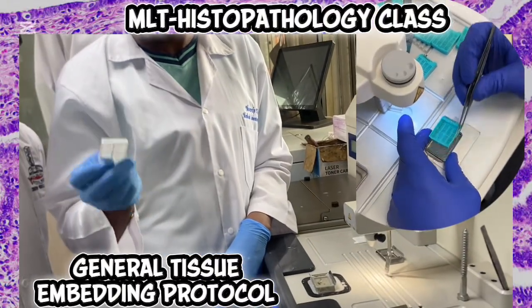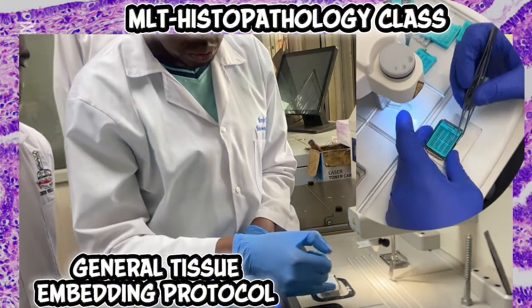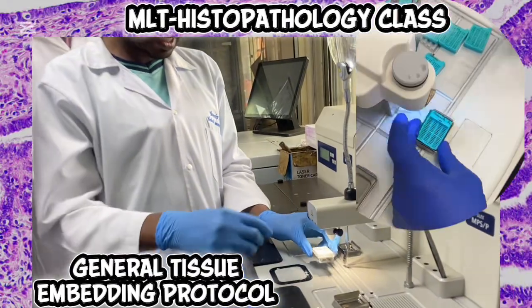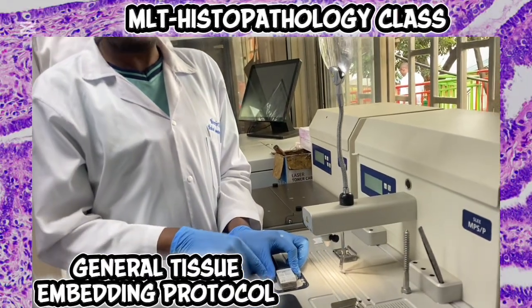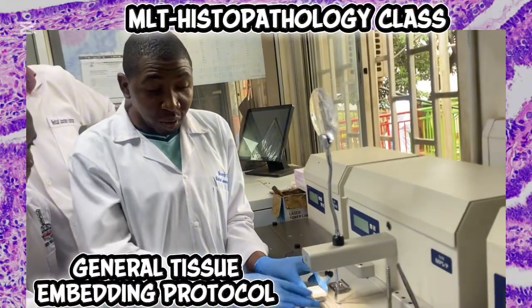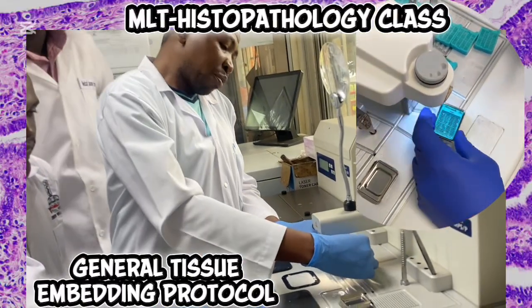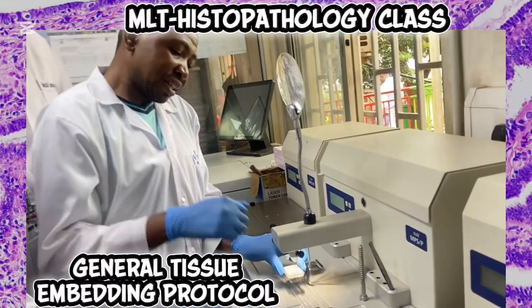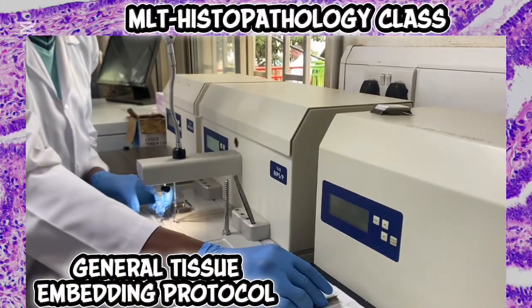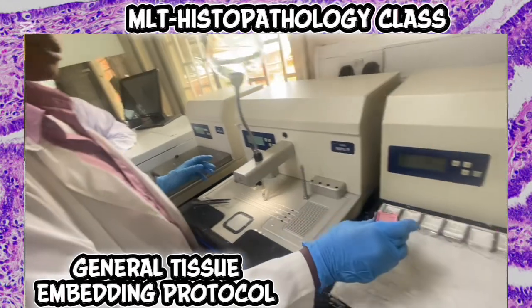We use the tissue cassette base and place it on top. The tissue cassette base has the patient's identification. We raise. So from the small cold plate, we don't put it on the warm surface. What will happen? It will melt, okay, because this is a warm surface. So you raise and completely fill with paraffin wax. Then you transfer to the large cold plate for complete solidification.